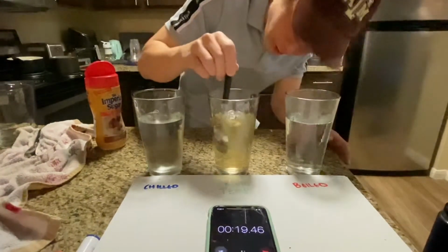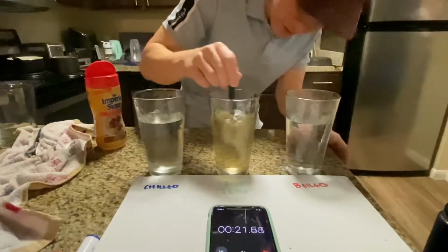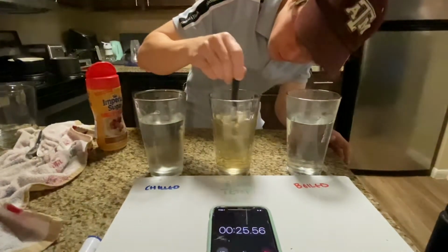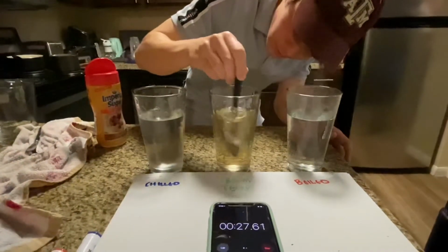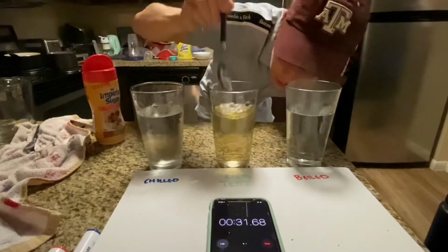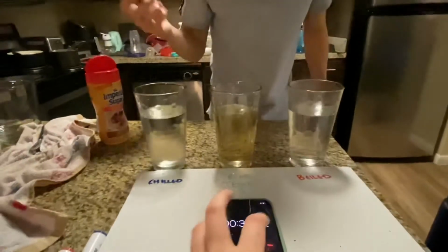And there are still particles in there, so we keep stirring. Alright, I think we'll call that completely dissolved.